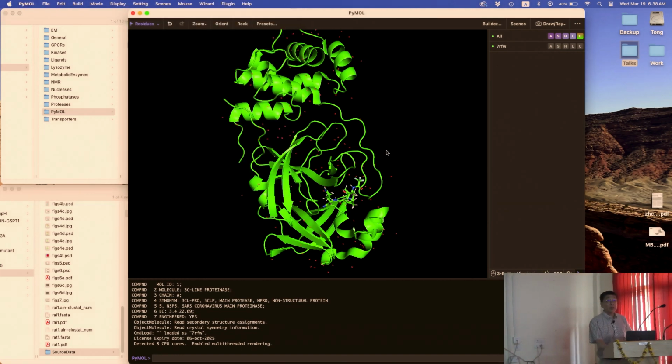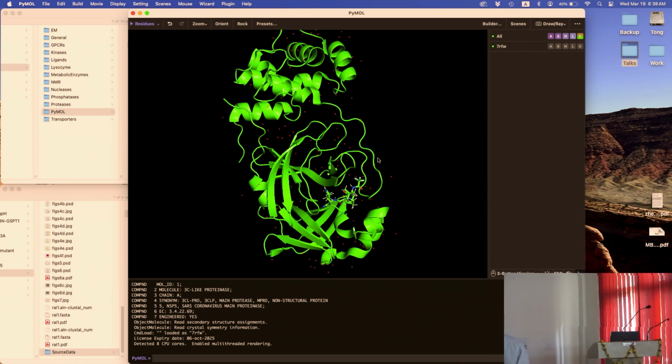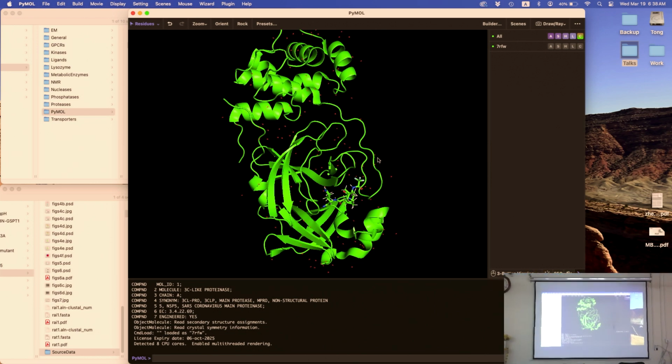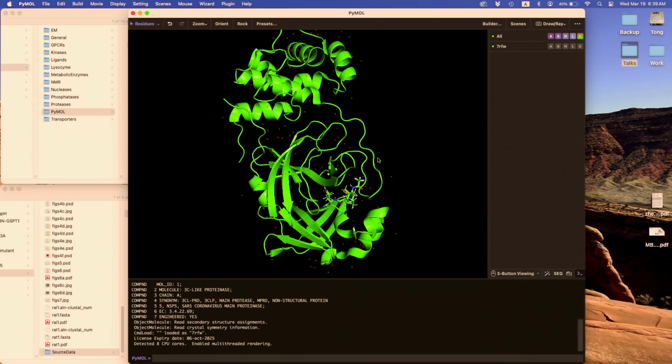Sir, in the document you have shared, the PyMOL primer. Yeah, you should have it. Yes, sir, I have. There is that molecule you asked a question about, the cysteine residue interacting with the ligand. Which structure is this one? Sir, that's 7RFW. So, okay. This is the ligand. Why is it pink? Oh yeah, that's a ligand. And you asked the question to check: there is cysteine residue 145 in that protein, and it is interacting with the drug molecule.